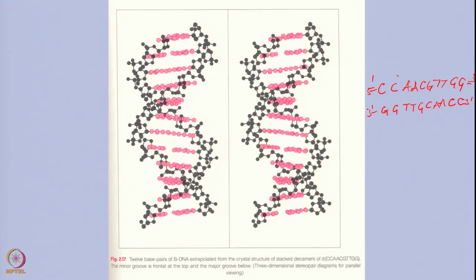So, therefore, this is called the self complementary sequence, and therefore one molecule which is there naturally goes into the form of a double helical structure like this, and this is easier to work with such molecules. Otherwise, you will have to generate 2 different kinds of sequences and then make a duplex structure. So, this molecule was chosen because it automatically forms the duplex structure as the most stable form. Okay. So, this is self complementary.